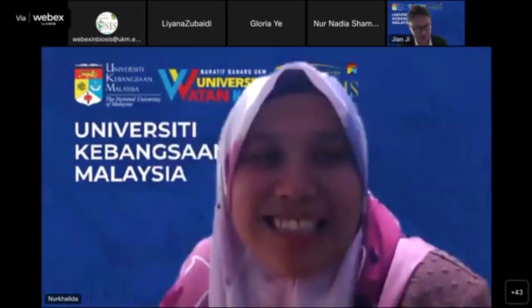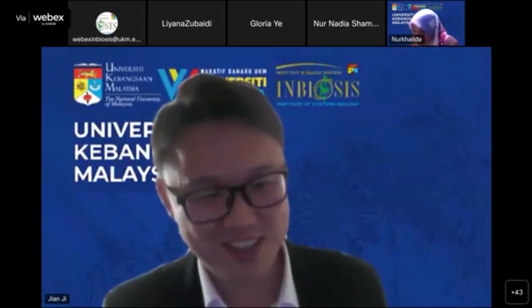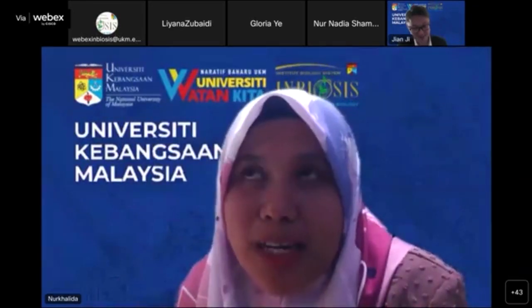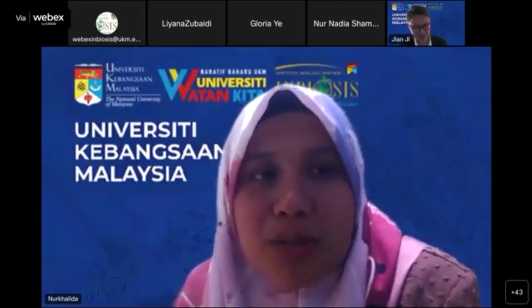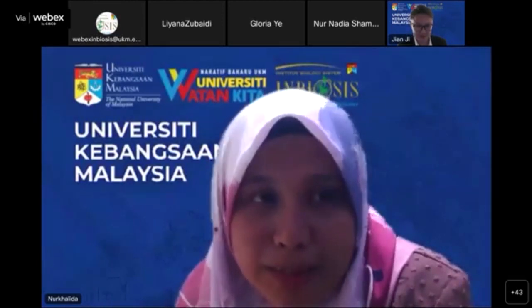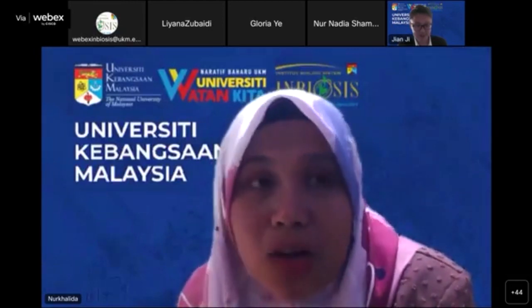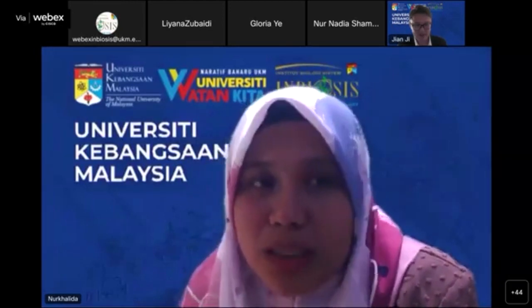Use LCMS, yes. Understand. So did you use LCMS or GCMS in your laboratory? It depends on what objective we want to answer. Of course, if we want to know the mechanism, we will go for primary metabolites, and of course, we will use GCMS compared to LCMS. But if we are working on secondary metabolites, normally I use LCMS compared to GCMS.